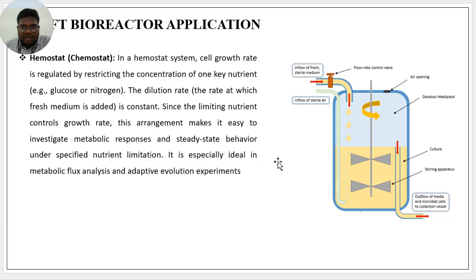These are the main and preliminary applications of bioreactors in animal cell culture.